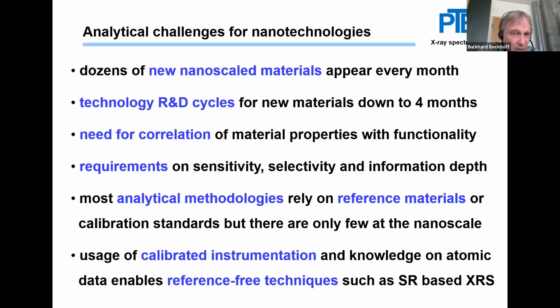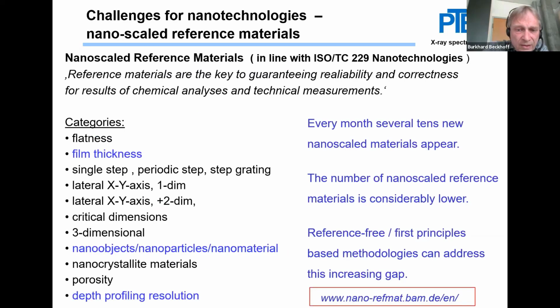So what we are doing, complementary to this chemical traceability chain, is this: chemical traceability means you refer to certified reference materials, which are calibration standards that are qualified by traceable methods. Complementary to that, we deal with the instrumentation that we use. So we calibrate the unknown instrumental parameters, the efficiencies of the instrument, and then use knowledge on interaction cross-sections to do the quantification.